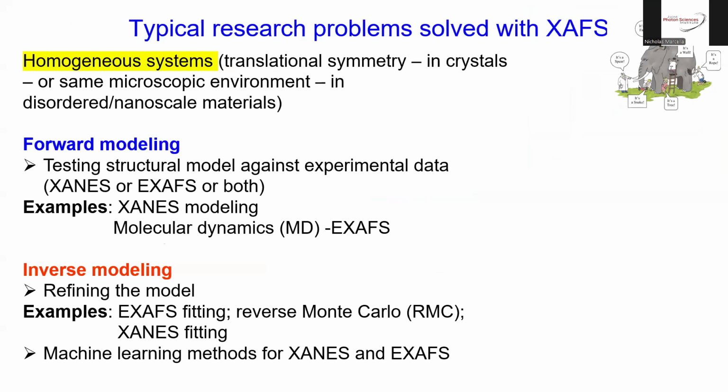And if you think about it as some kind of representative structure, and you don't know about this heterogeneity, you can get very different results than it should be. Because it's like averaging the temperature of the patients in the hospital. Some of them have fever, some of them are cold. The average temperature will not tell you anything, because there may be no patient with that temperature, and you don't know. So you need to really clearly understand whether your system is homogeneous or heterogeneous.